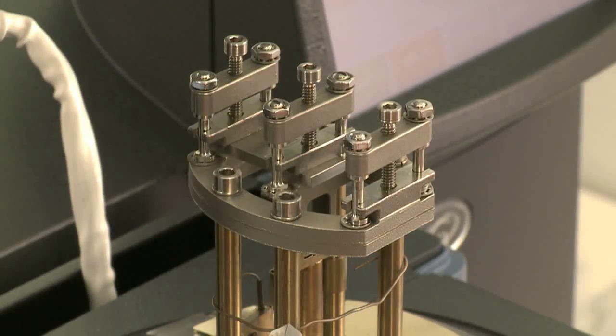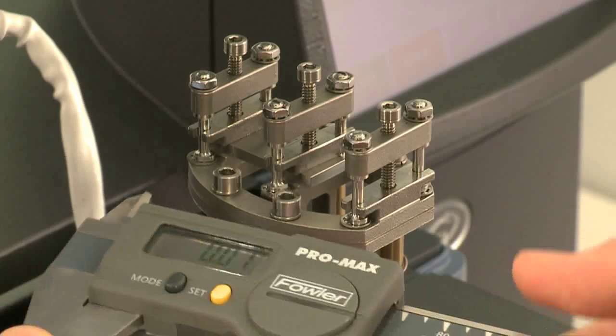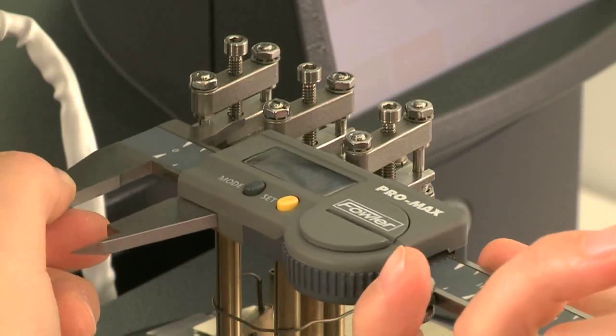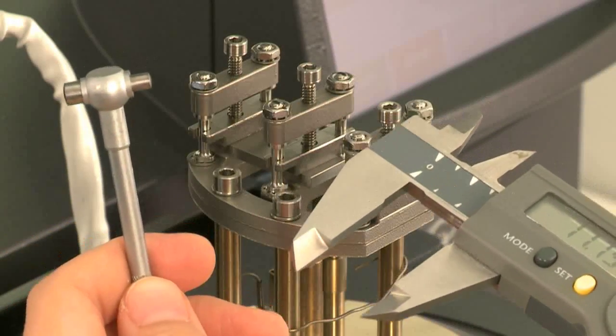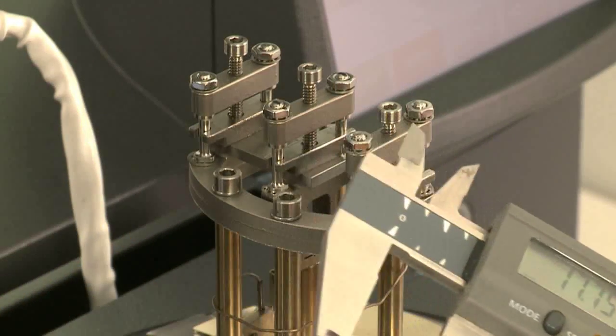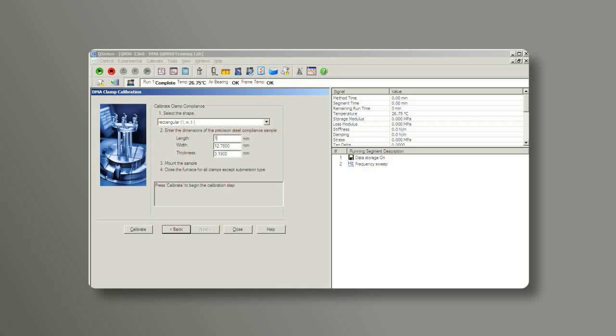Now we need to measure the length of the steel bar. You can either use a caliper or this lens gauge to measure the length of the bar. Enter the dimensions of the steel bar into the software, then click on calibrate.